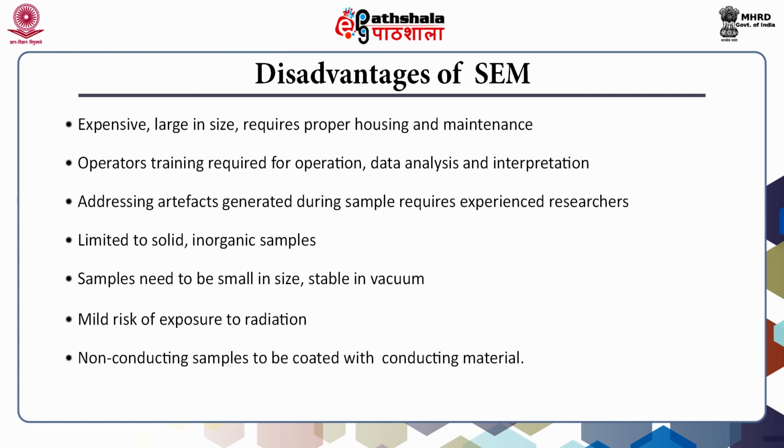Non-conducting sample to be observed under conventional scanning electron microscopy needs to be specifically coated with electrically conductive material. It does not provide information on living cells or sample. It is only applicable for fixed samples which are not living.